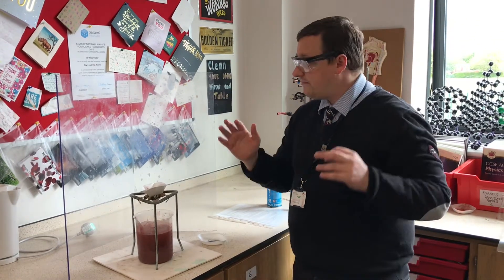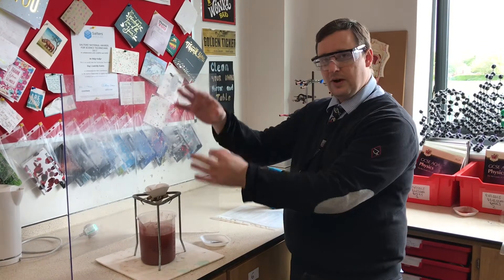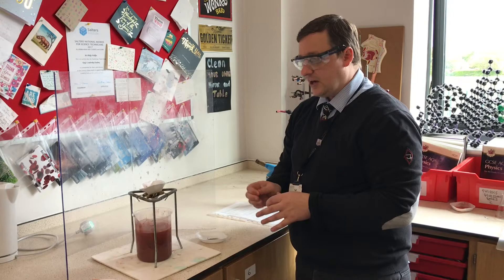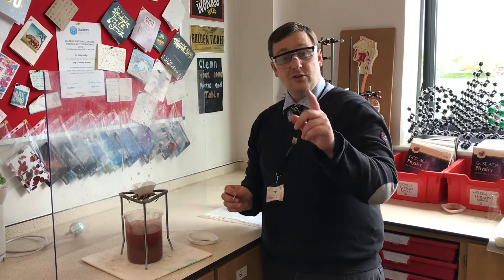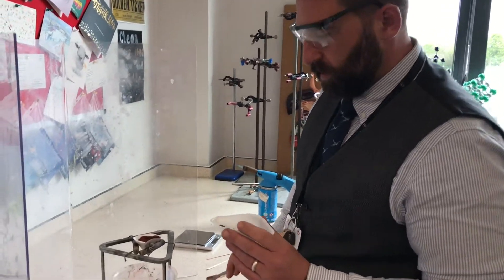We have to do this incredibly safely. I have got my spectacles on and we've got a shield to make sure nothing goes backwards. It might be quite spectacular but it should be pretty safe. So I'm going to let Mr. Thomas do this experiment now.